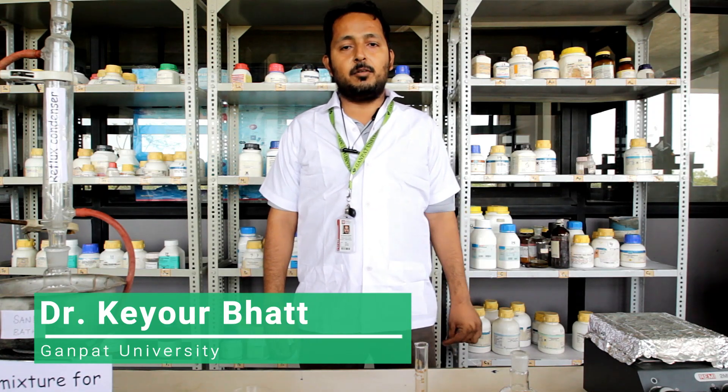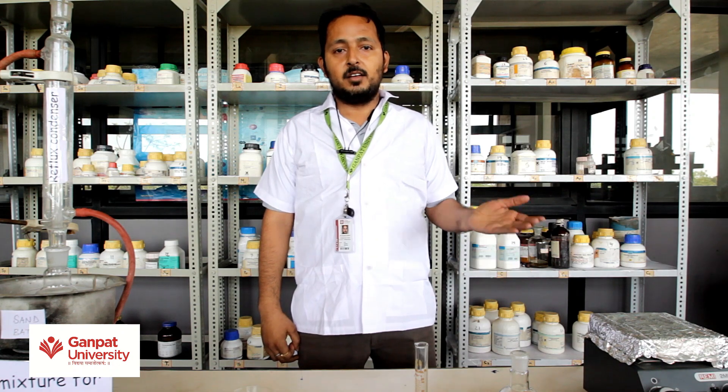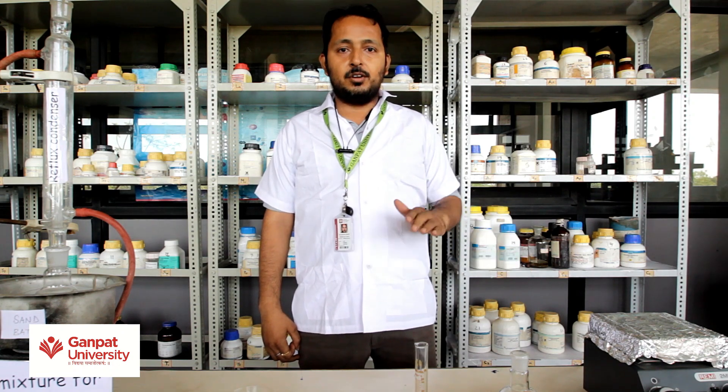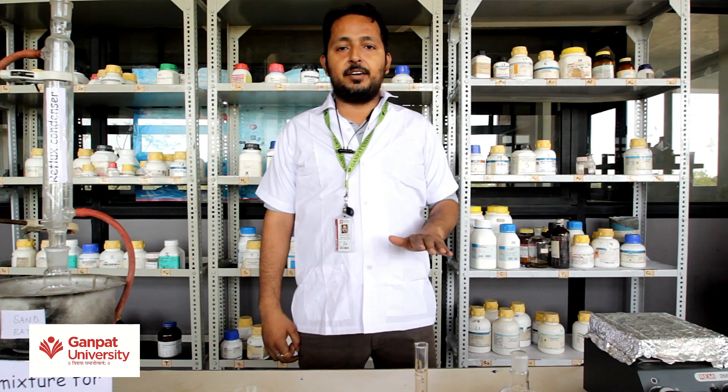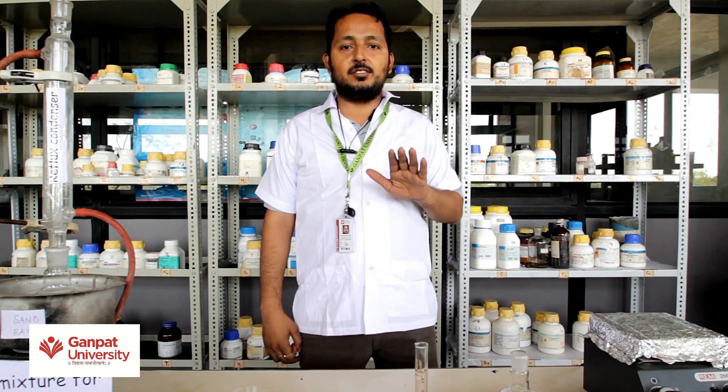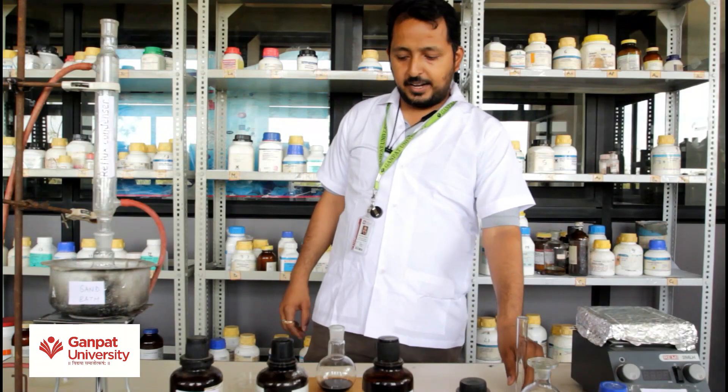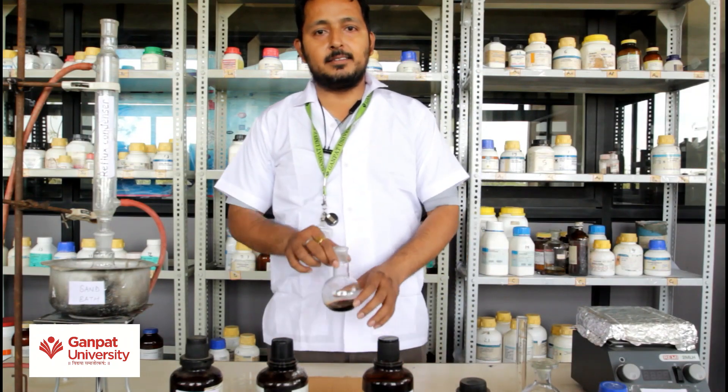Good morning friends, today we are going to synthesize acetanilide from aniline. Before starting the practical, make sure all your apparatus is washed with distilled water. Now take a round bottom glass.